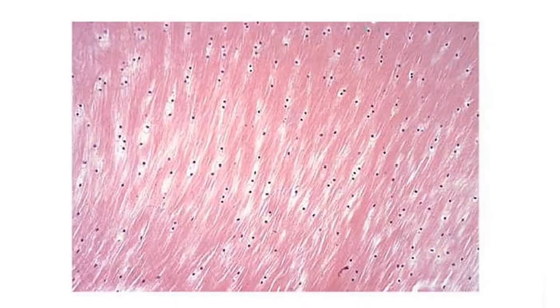All right, this one's one of the harder ones. What do you see? I see wispy clouds. I see cotton candy. I see rows of ants crawling along my cotton candy. So what I'm looking at here is fibrocartilage. Again, to me, the most missed one I've seen over the years. A tough one to get. If you got this one right, you badass, right?